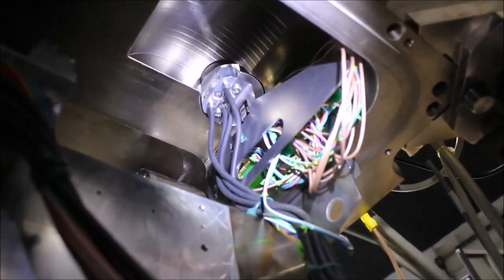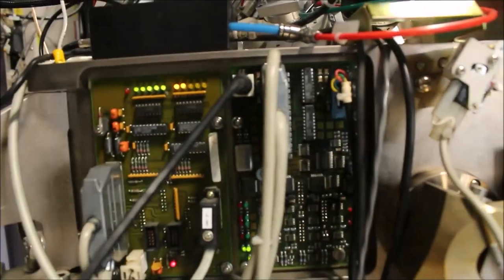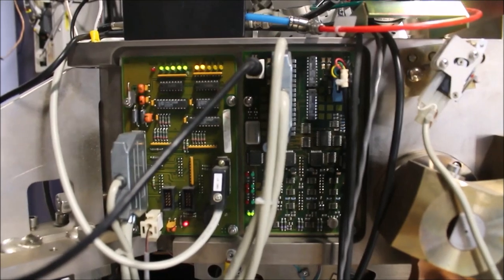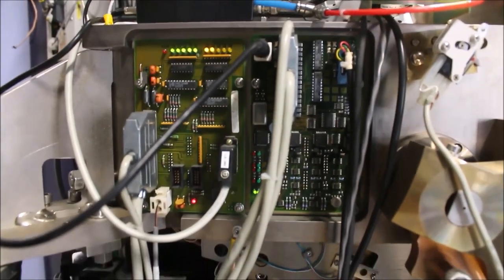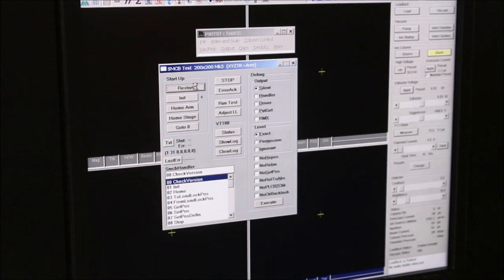Check that you get your electronics and tubing and the stage ground connected and then run over here and connect your SMC and SBB connectors. Now you should be ready for action. We can run over, open P90 test and we can hit restart. We can hear pretty soon the motors moving.